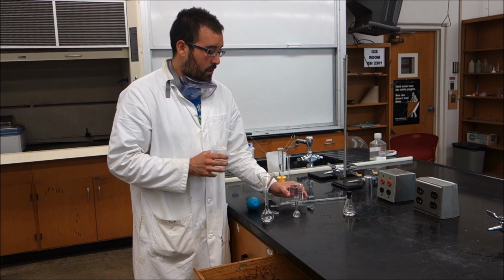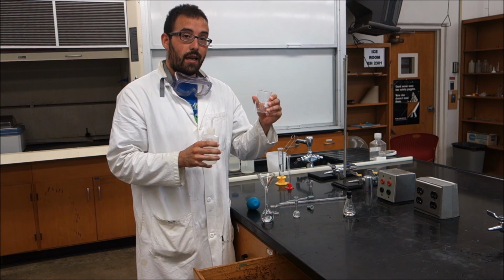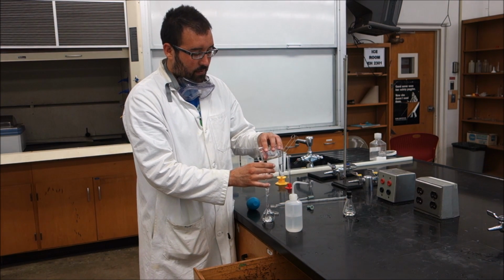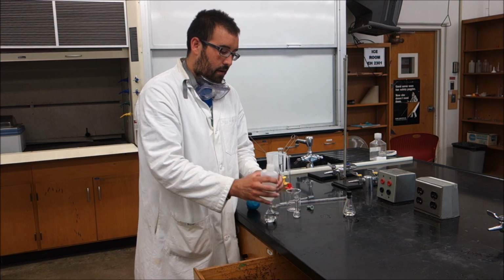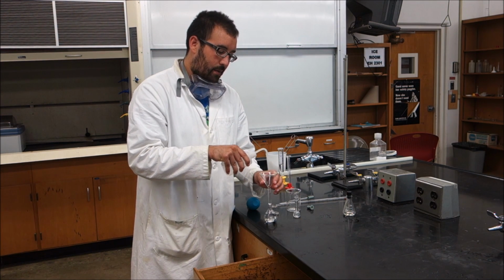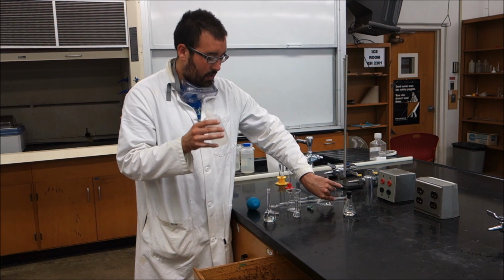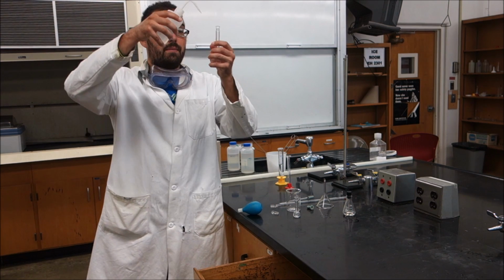Now, what we want to do here is first squirt a little bit of water in our container so we get any residue that's left over in here. And then we're going to transfer it over the funnel, and that way we get any residue that's left over. Then we'll take our squirt bottle or our Pasteur pipette and then top this guy off as well.